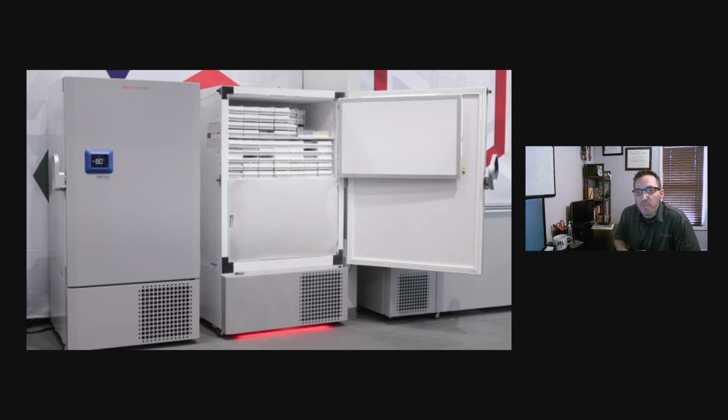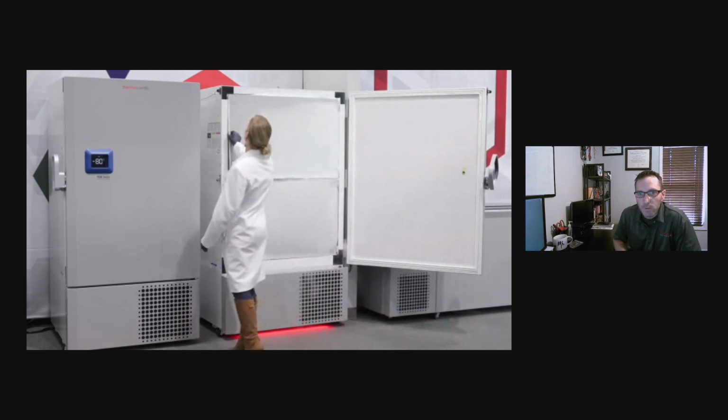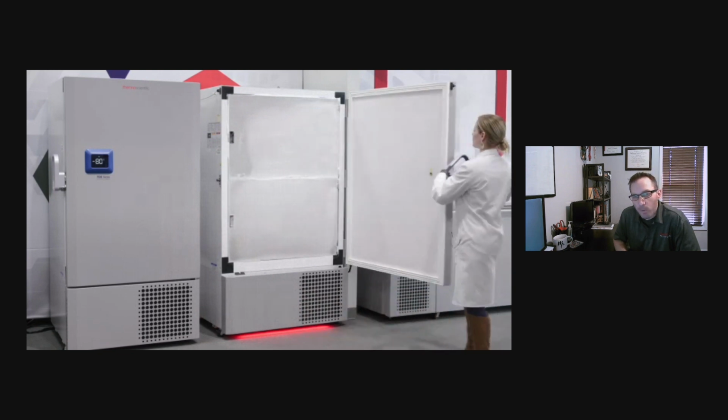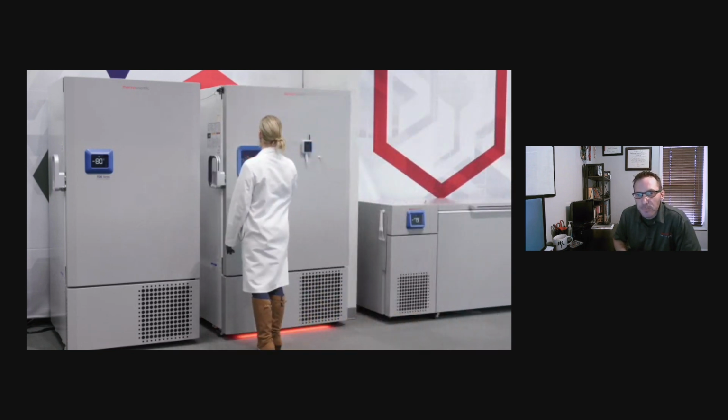It begs the next question as well, right? When it comes to preventative maintenance on a freezer, removing ice, making sure that everything is clear and clean will minimize the effects of door openings, because if your inner doors are frozen over or frost buildup has accumulated, you might intend to open one door and open up both. That means more cold leaves the cabinet, more heat enters.